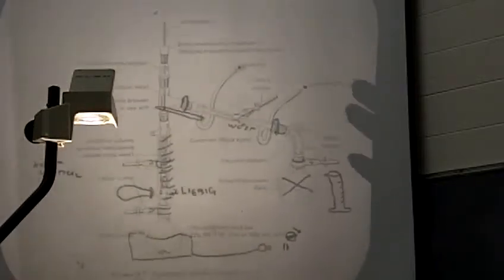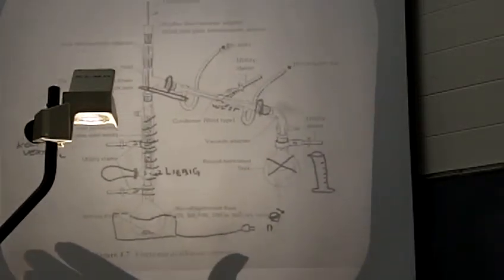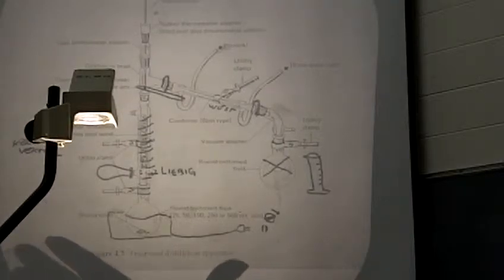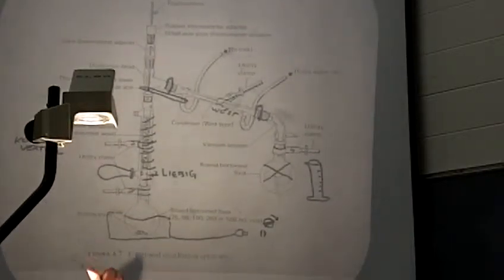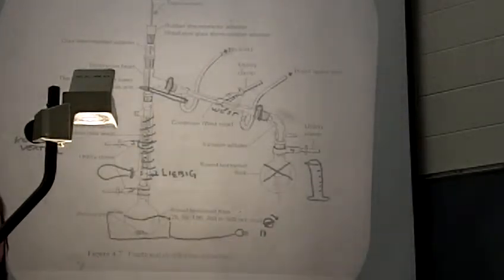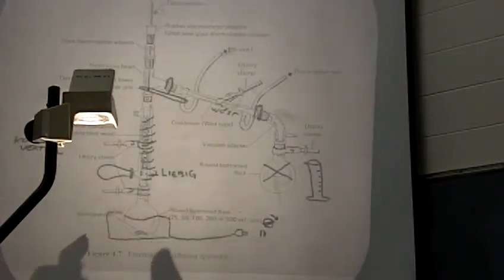Okay? And so this is what your setup for this week is going to look like, okay? This is figure 4.7 from your lab manual. I'm just going to go through some specifics here and some things to keep an eye on as you are setting it up, okay? So first of all, I would set this up over your stir hot plate.